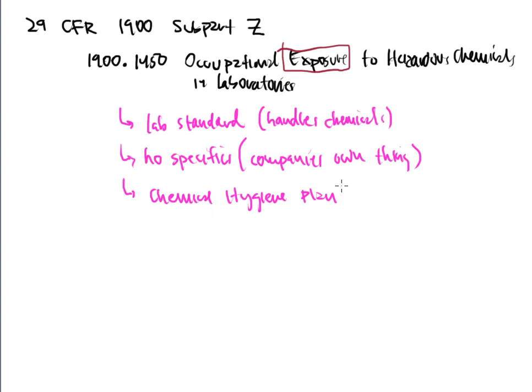And this basically tells people, what do you do in case there's a spill? What do you do when you have to send waste off for disposal? Those are the types of things that we see here. When should you pull the fire alarm? When should you call the authorities? That's the Chemical Hygiene Plan. Where should things be stored? What locations should they be stored in? So chemical hygiene, think of your own hygiene. You take care of yourself every day, right? This is how we take care of chemicals and take care of the laboratory every single day.